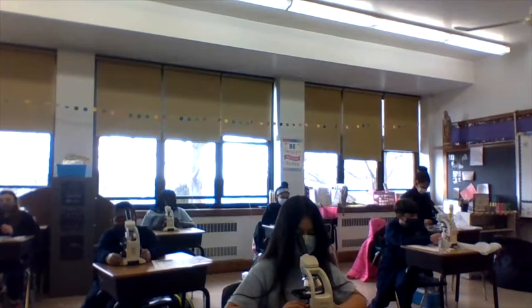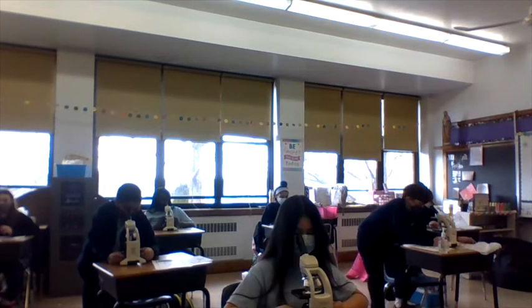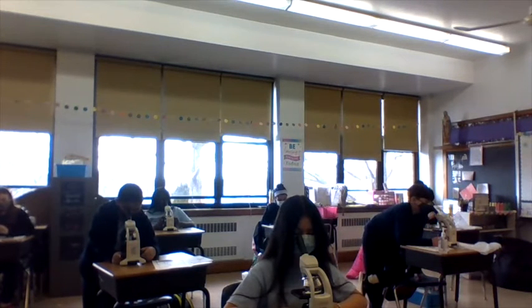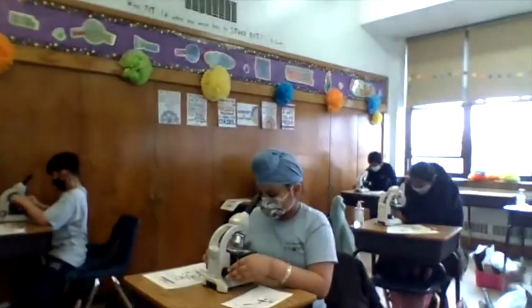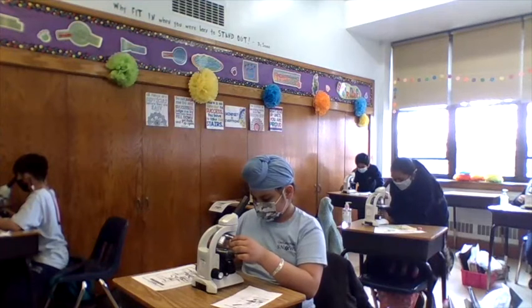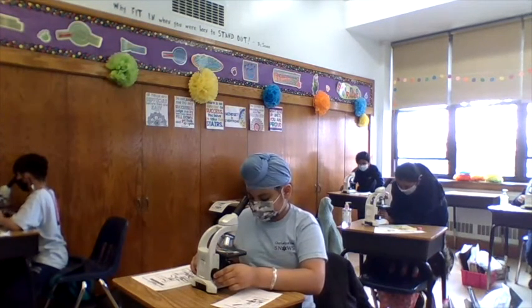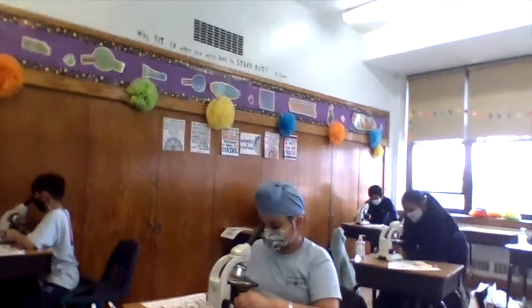You guys are doing a good job. Oh, I see some. You do? So then if you think you see something, then work with the fine knob. Good job. Take your time. Great job, Ariel. I can see the vein. You can see the veins? Do you have a leaf? I can see little cracks in them. It's really neat.